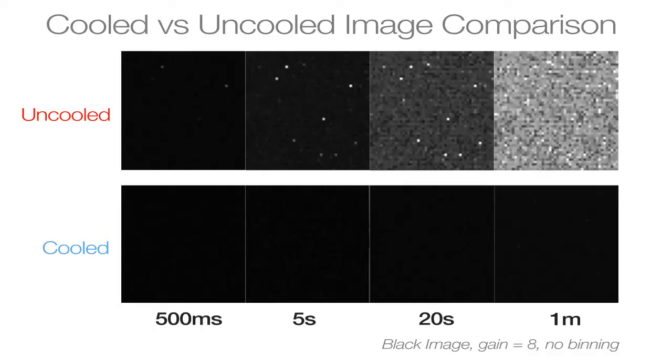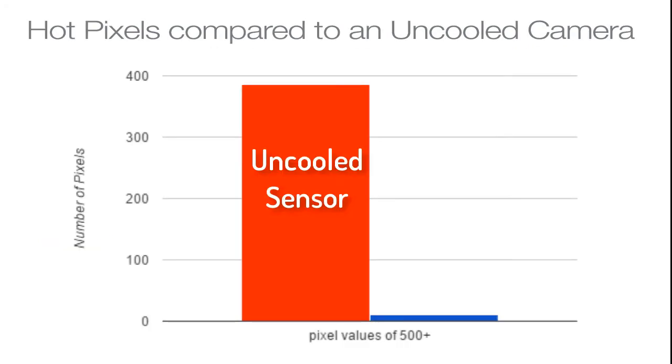If you're struggling with noise in your images, here's what cooling can do for you. In this graphic, you can see how the uncooled image becomes filled with noise as the exposure time increases, whereas the cooled images remain deeper and darker. This graph shows you the drastic reduction of hot pixels in comparison to an uncooled camera.